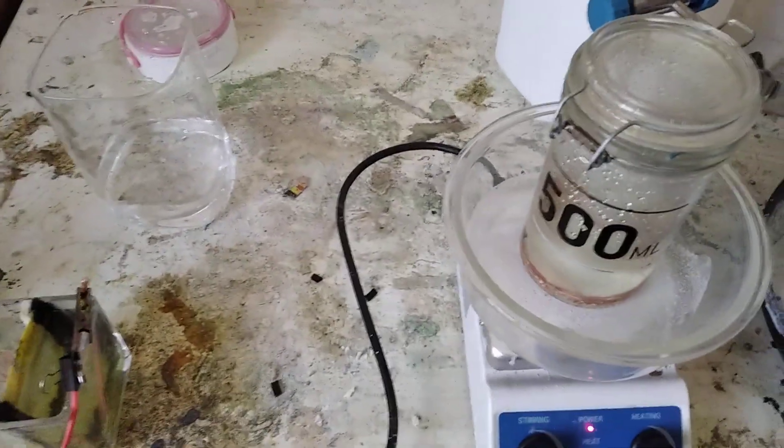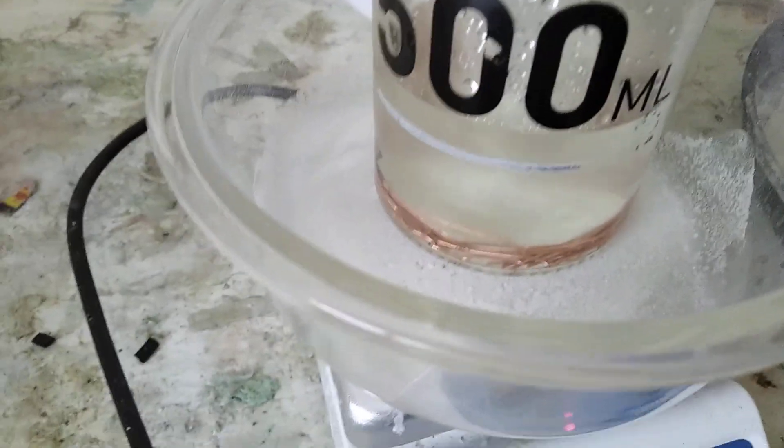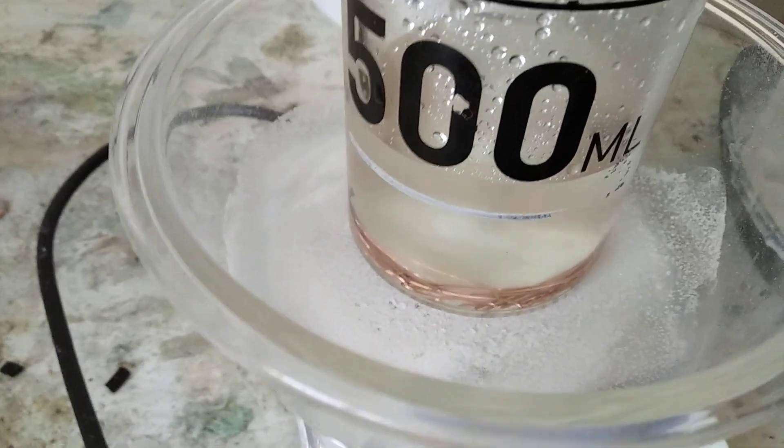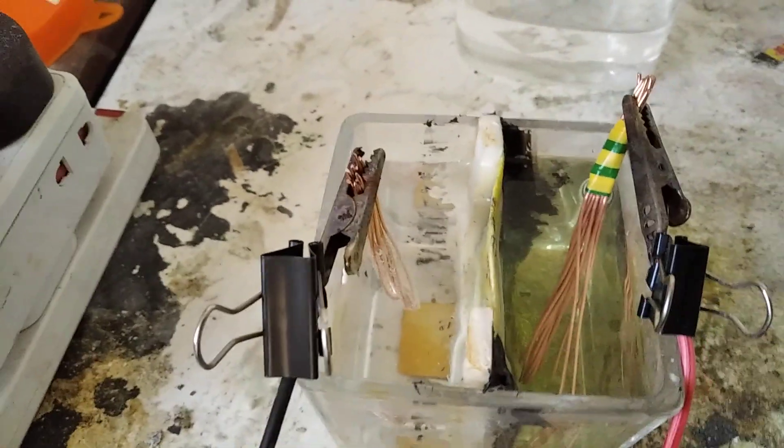Now what we're doing here is we're trying to figure out which is the faster way to produce copper chloride — either the way everyone else does it, with some air and some copper in 34% hydrochloric acid, or membrane electrolysis.